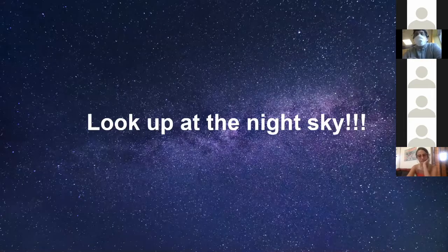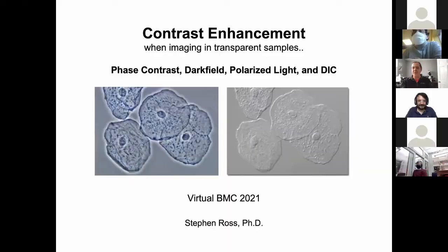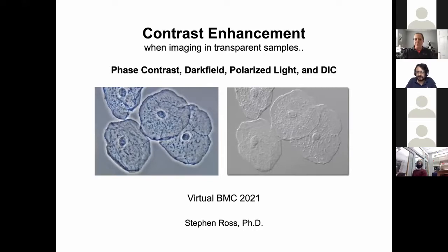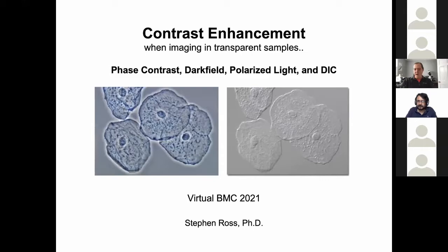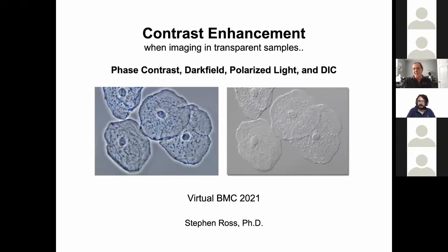The second speaker introduces the next topic: building on the foundation just presented about how a microscope works and forms an image, the next step is to talk about contrast enhancement, which is critical for visualizing things in samples that often have very little natural contrast. Shown here are a phase contrast image and a differential interference contrast image.